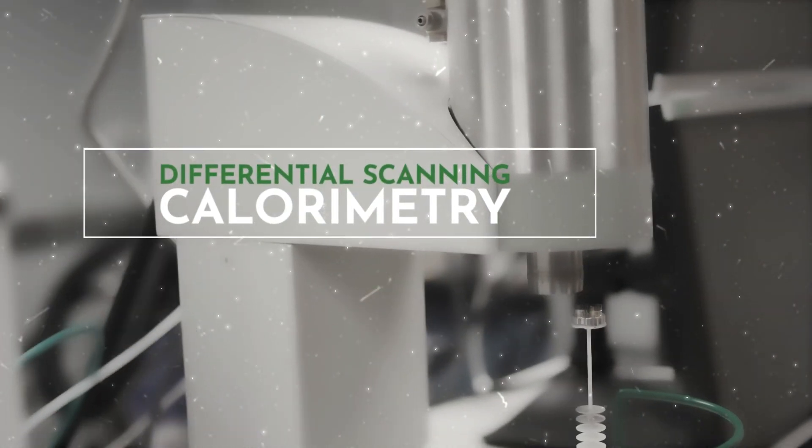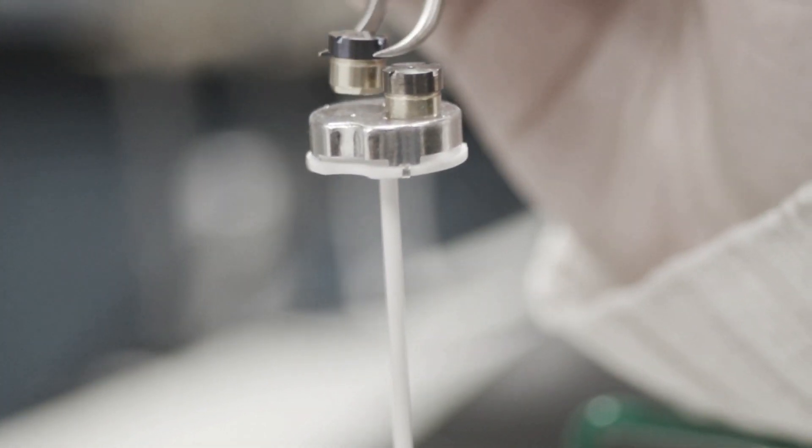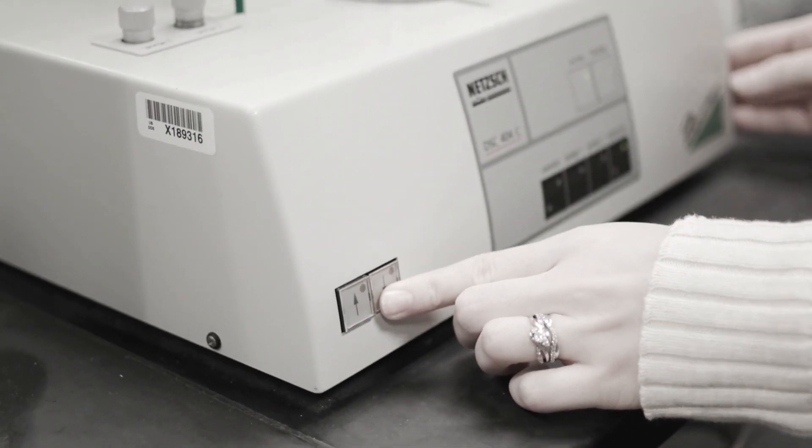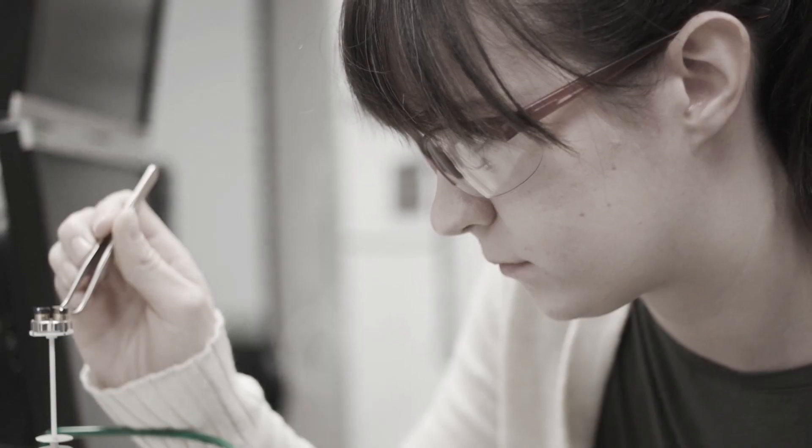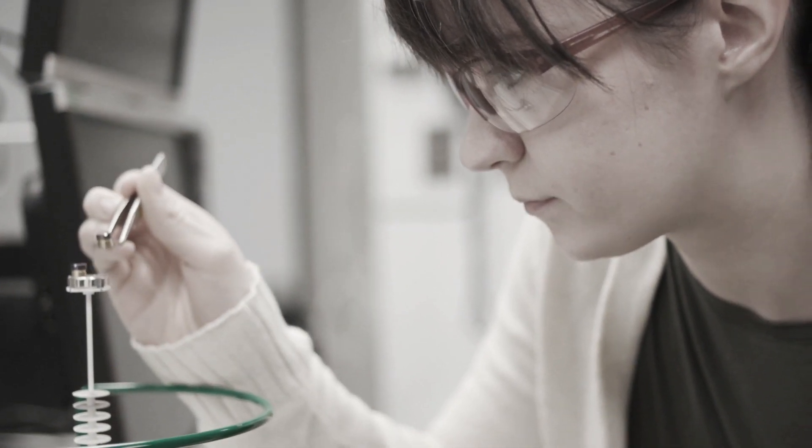It's also really important to look at the heat capacity for the coolant and fuel salts. I'm using a differential scanning calorimeter to be able to determine what the melting points and the heat capacities are for the different salts. The one I'm working on right now is the coolant salt.